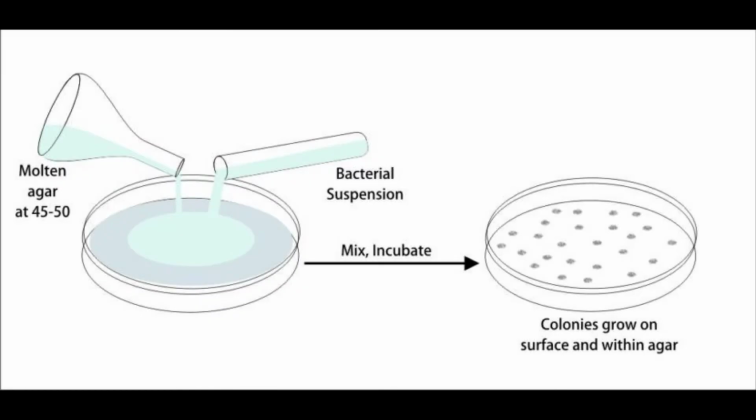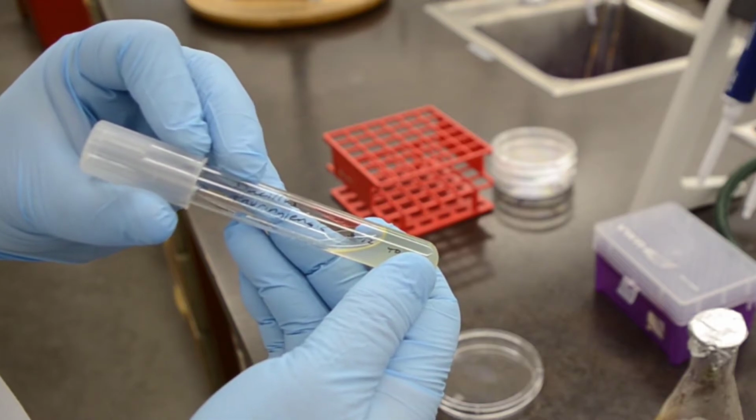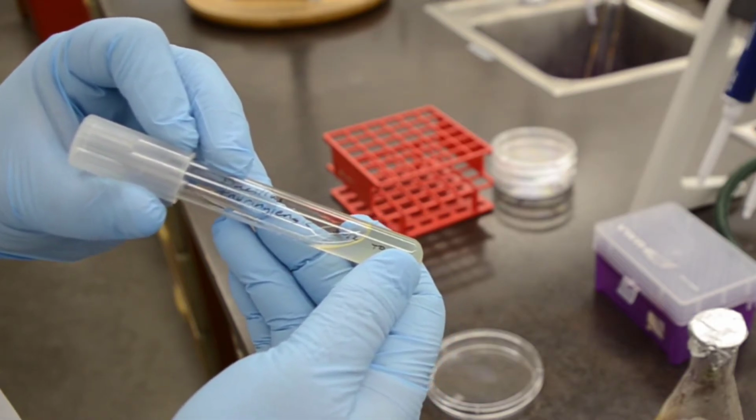Today we are going to be looking at our first method of isolating bacteria, called pour plating. In order to study a particular bacterial species, you must first make sure that you have a pure culture of it, and that begins with isolation. In this simplified diagram, we see that we mix a bacterial suspension with something called molten agar, and then after we allow it to incubate, we see colonies growing on the surface and within the agar. We could then harvest one of those colonies and establish a new culture which we could then consider to be a pure culture. Here we see a tube of contaminated Bacillus thuringiensis culture that we will use in the pour plate procedure.